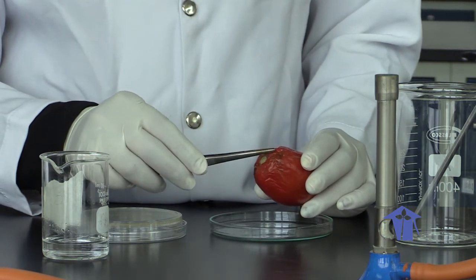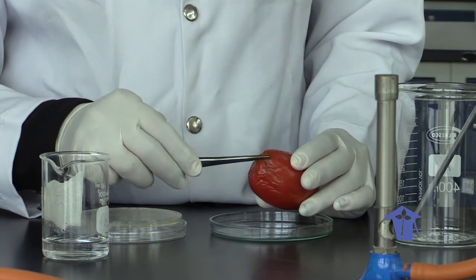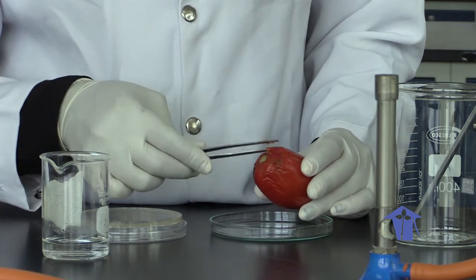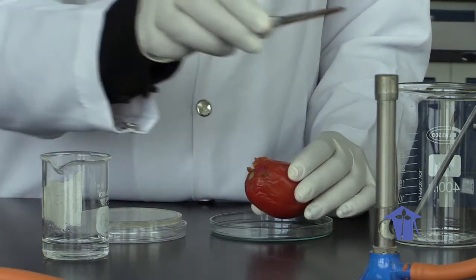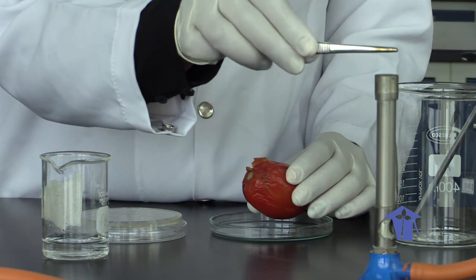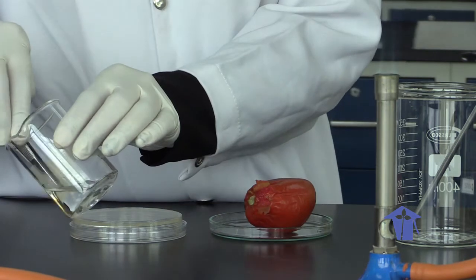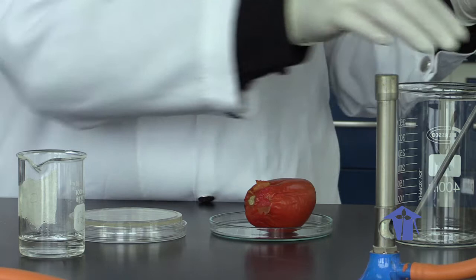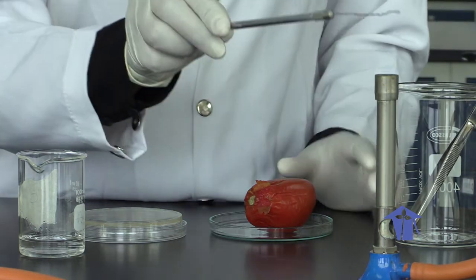So just remove some of the surface of the tomato skin in the region where you see signs of the disease. So you have it exposed there. Remember to again flame your forceps to remove any contamination. And then we're taking our inoculating loop, sterilized.